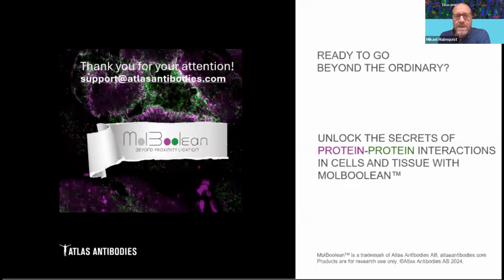How is MolBoolean different from detecting protein-protein interaction using FRET between two different fluorophore-tagged antibodies? I think it's a similar approach, and I think FRET has advantages. The main advantage with MolBoolean is that you get a signal amplification. For antibody-based FRET, you have two different fluorophores, and you can get a certain amount of fluorescence out. For MolBoolean, we have 1,000 fluorophores per every molecule. So you get a much brighter signal, so it's easier to quantify. Yes, great.